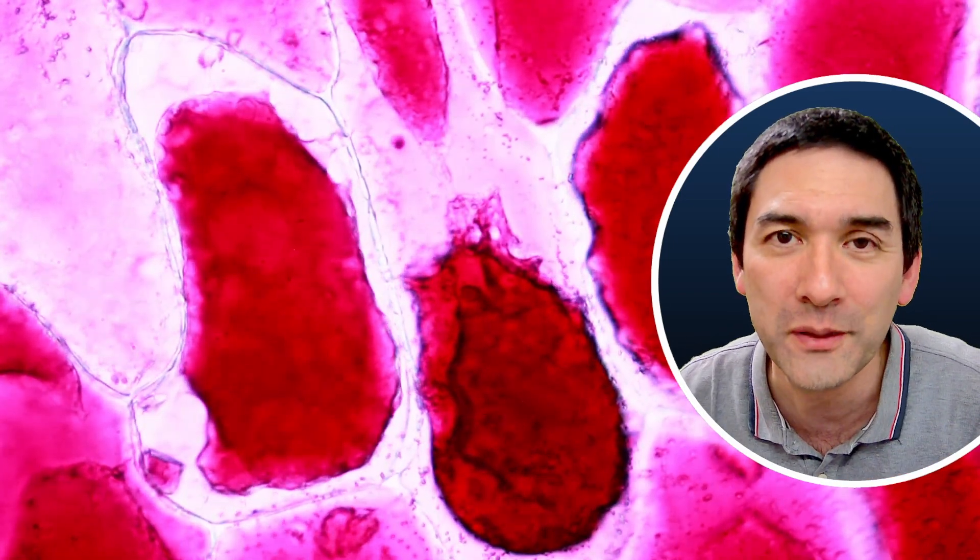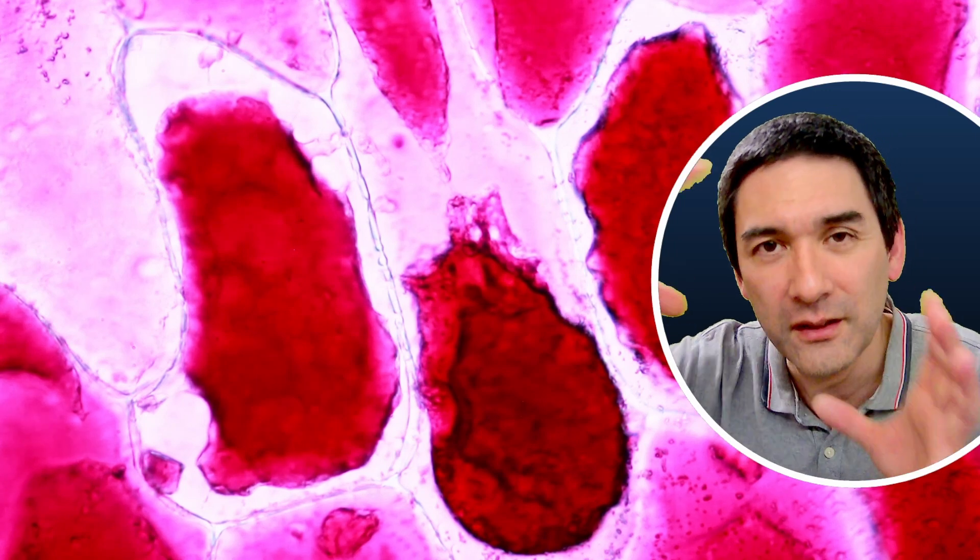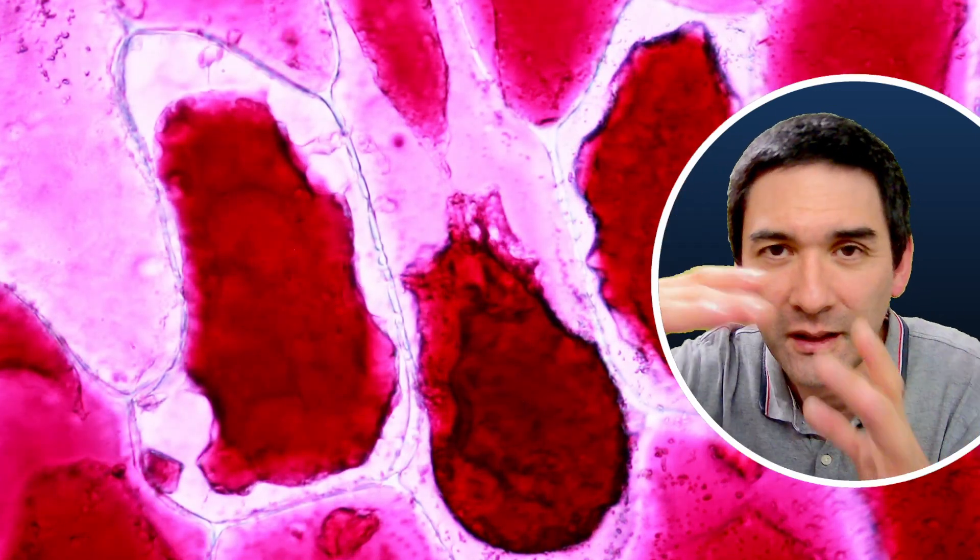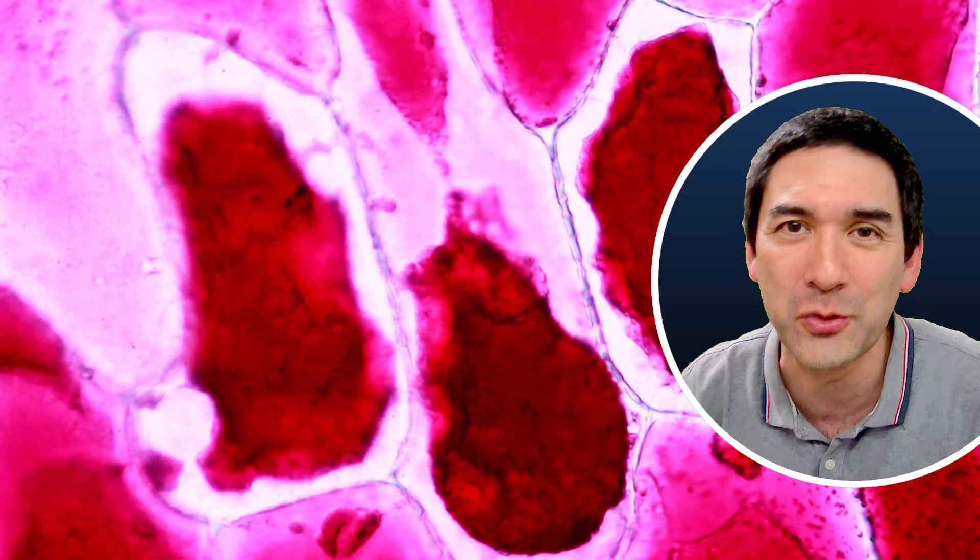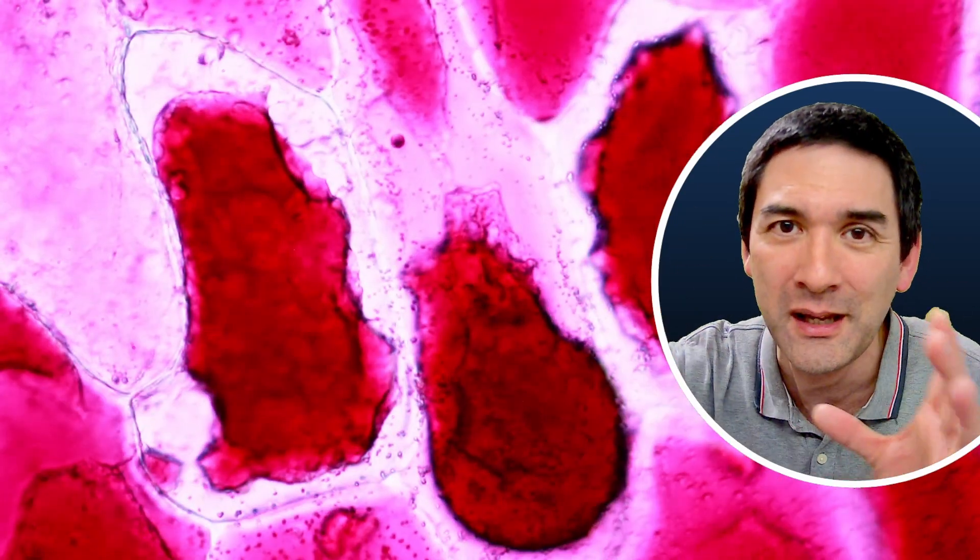Here again, here, zoomed in quite a bit. And you can see that the outside, the cell wall, the overall shape of the cell is still intact, but it's actually only the contents that starts to shrink here. In the case of the paramecia and the red blood cells, this was quite different. The whole cell started to collapse because they did not have a strong cell wall around it.